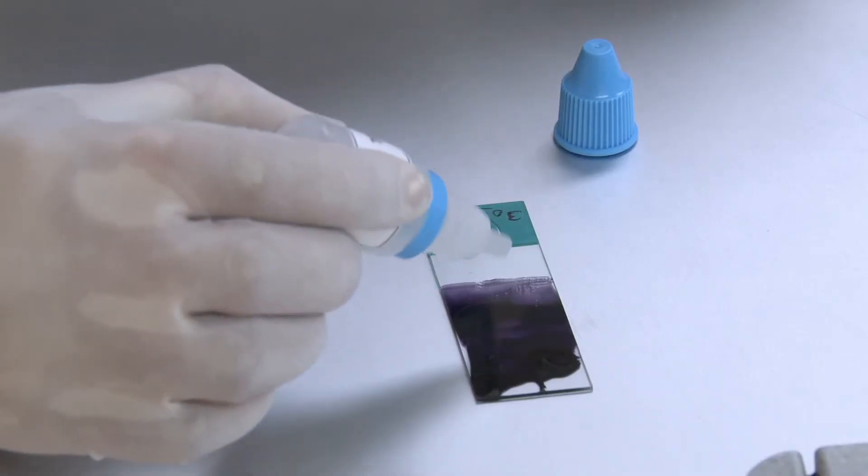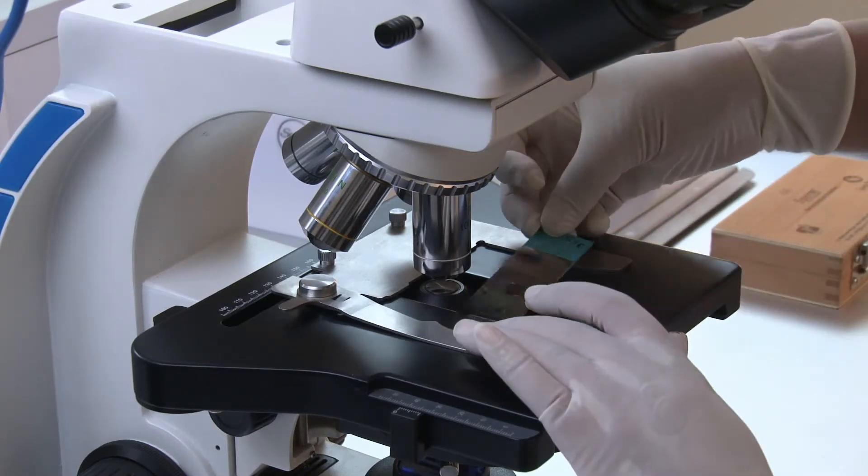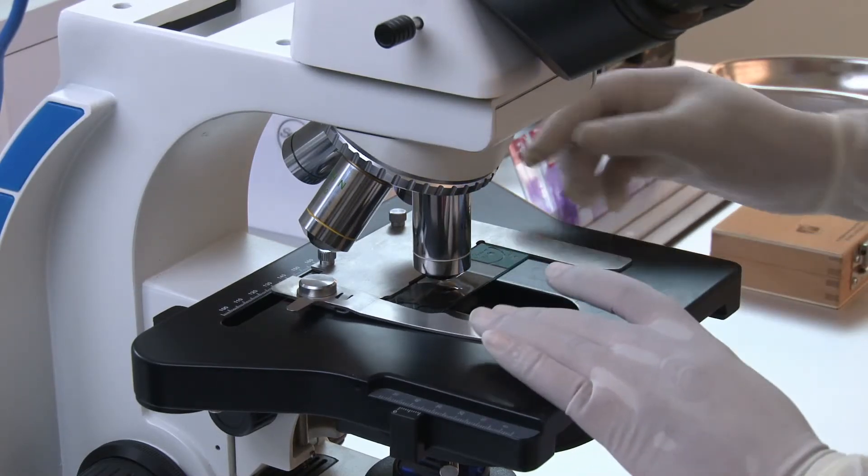Place a drop of oil immersion on the smear. Observe the smear under the microscope using 100X magnification.